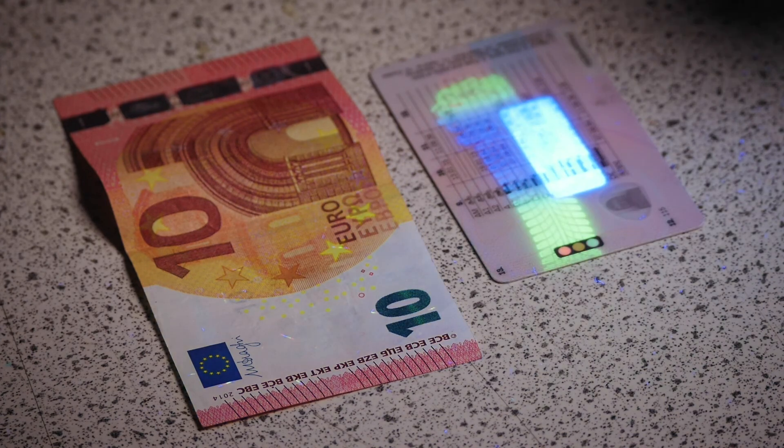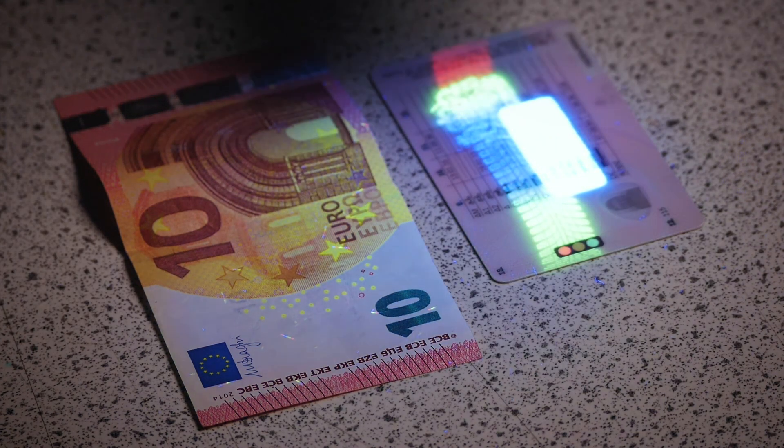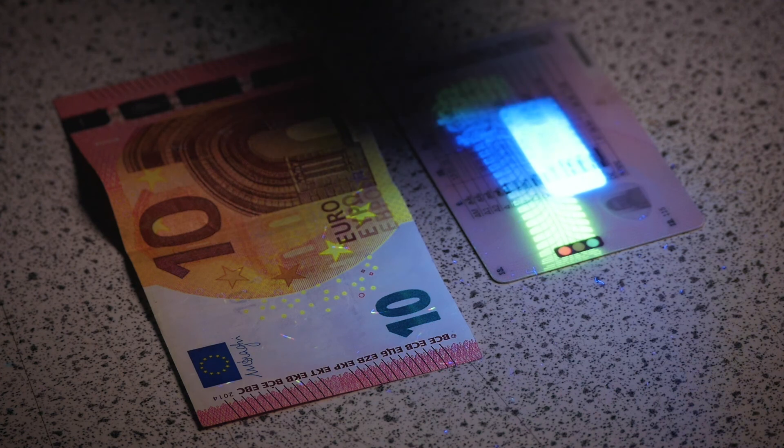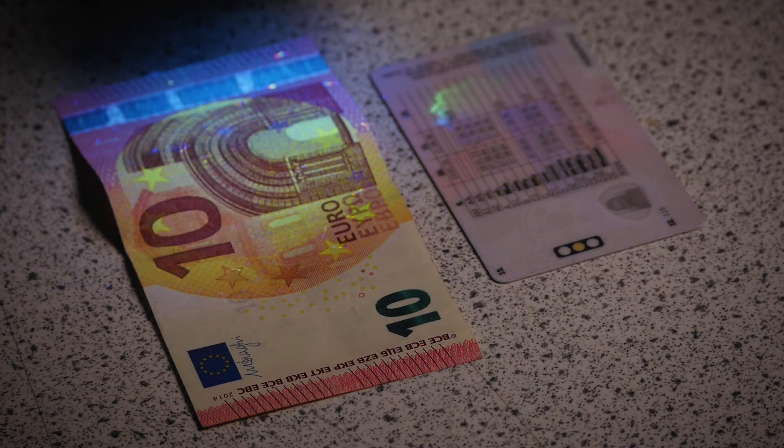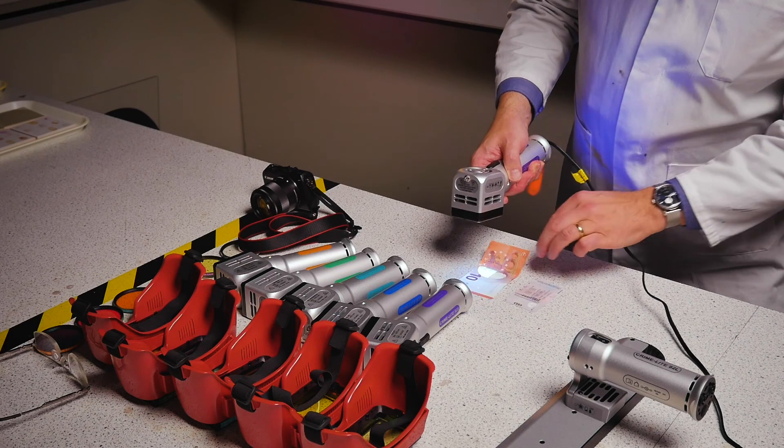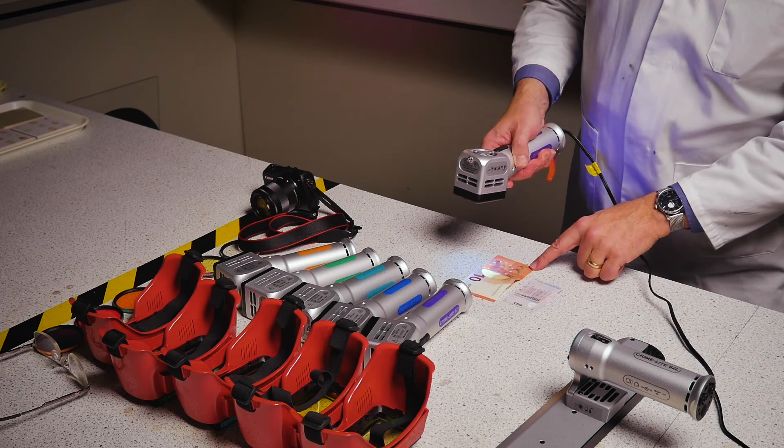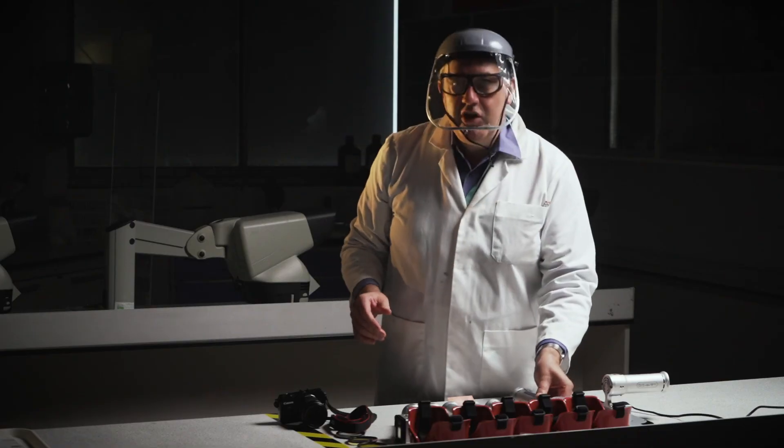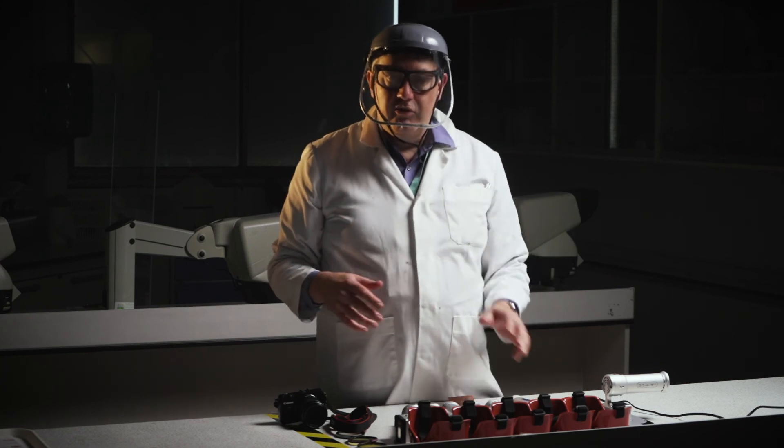And we can see that we have some quite bright fluorescence from the security features in the back of the driving license, and also some of the things on the €10 note. And we can see there are slightly different things on the other side. So that's a very quick practical demonstration of how the light sources work.